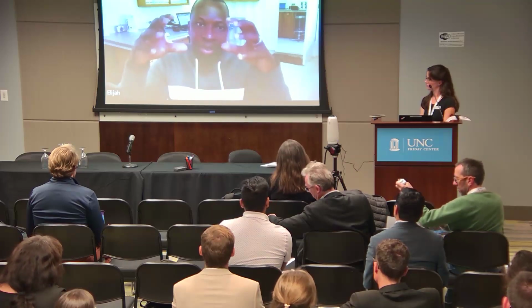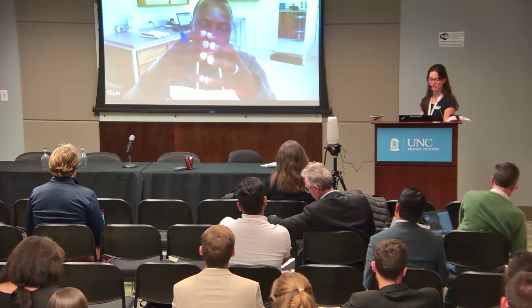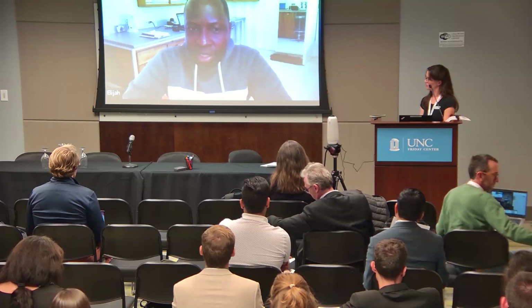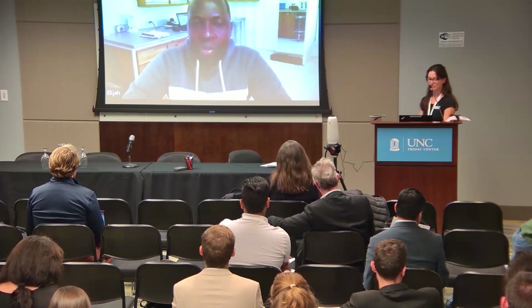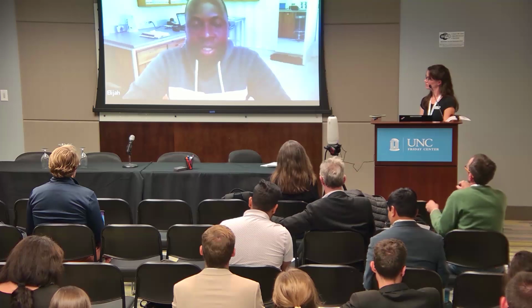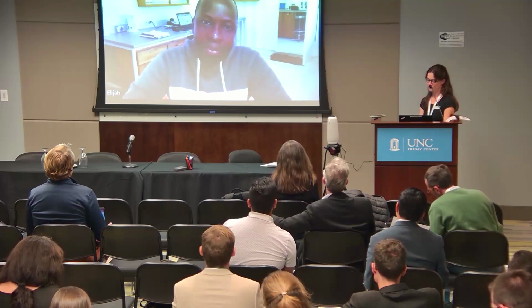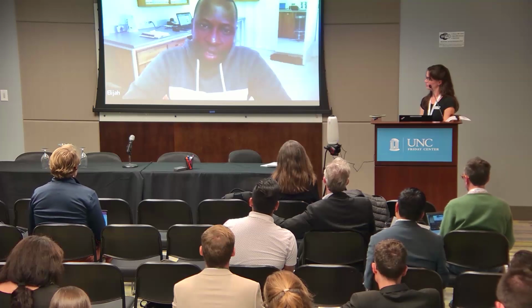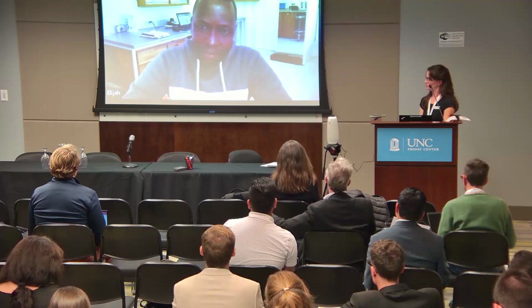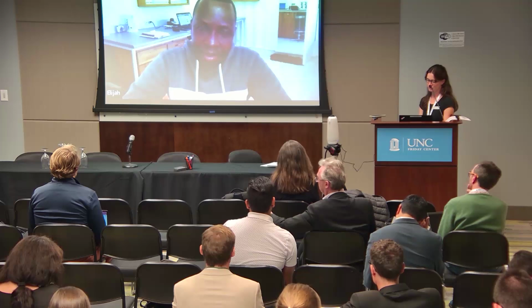So we do not only use the equipment for the implementation of Seeds of Hope, but in partnership with CAWST or collaboration over the years, we have used the same equipment to train people, like I've said, in introduction to drinking water quality testing, and many others.